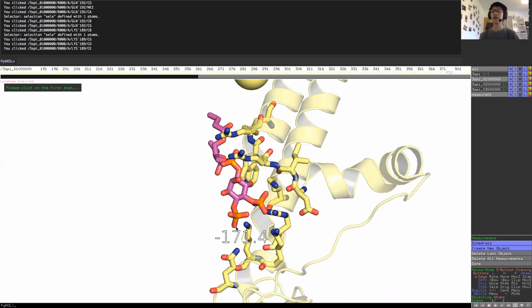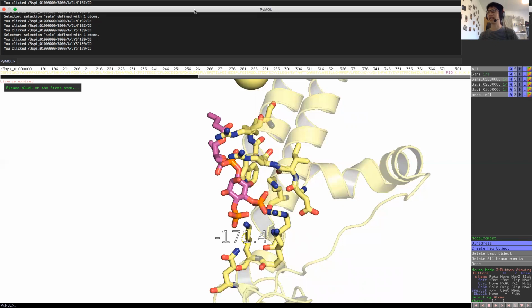But for a typical visualization of a structure and looking at how it might work and give us some ideas of how it might relate to function, these little tools in PyMol could provide you a guideline which can help you get through the basic understanding of the molecular structure.